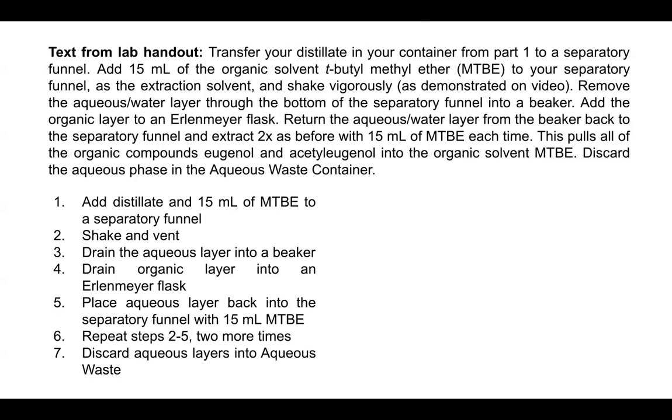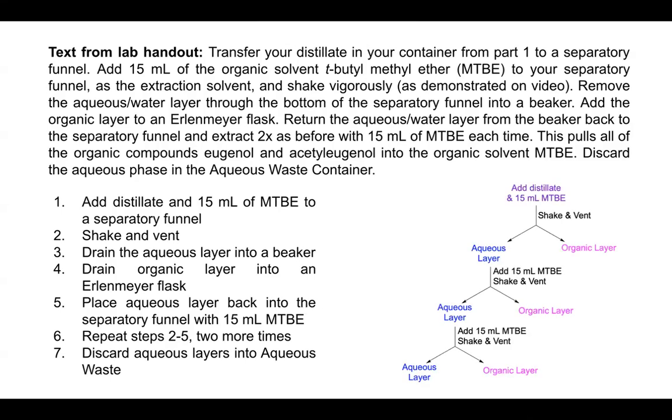An alternative method is to use little check boxes and then check them off as you go through the lab. I've seen students do that, and it's worked really well to keep you on task. Another way that you can also use to describe a procedure is using pictures or diagrams. So this diagram is saying the same thing as this procedure. Okay.